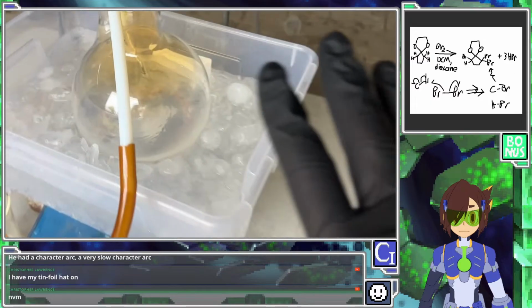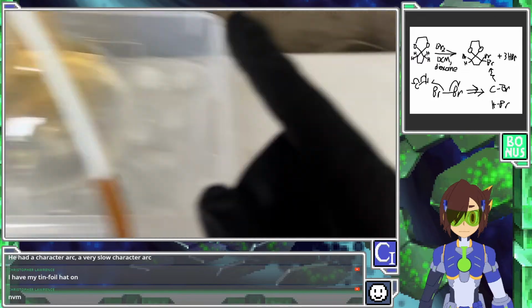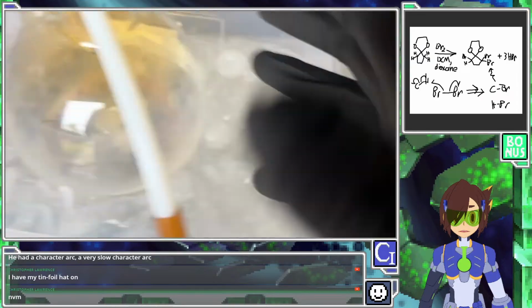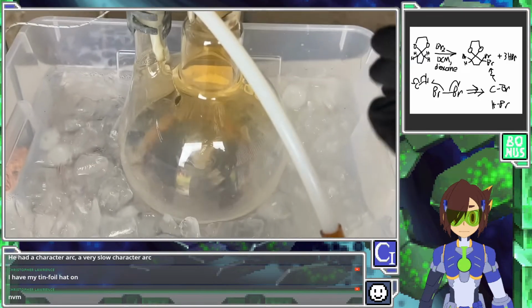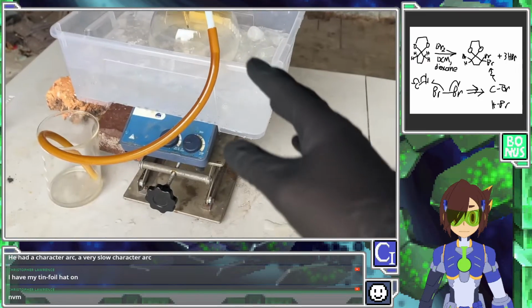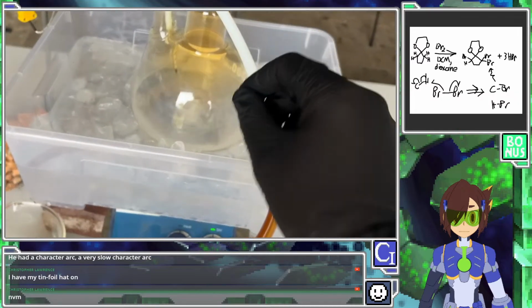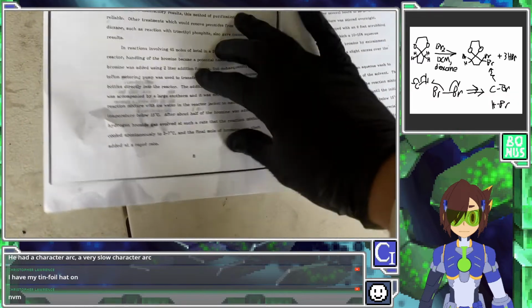When we were considering doing the reaction the other day, the room temperature was 39 degrees, and that's very bad. So we have to have very good cooling here. If his reaction's too hot, it just turns into tar. At large scale as well in proper laboratories, and they say stirring was very important. So we've got a bit of a weird tower here, which is a little bit unsettling. We've got high stirring, so when the bromine comes in, it should stir very well, which will help with cooling. Yeah, this temperature control is very important.